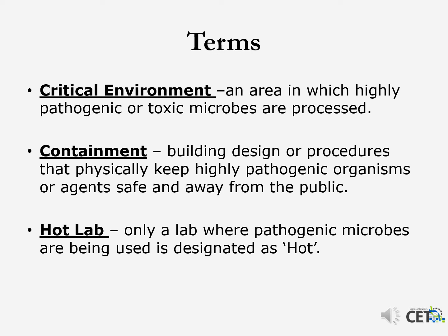The primary challenges working with microbes are contamination and aerosols. So we work on them in rooms that we call critical environments. The critical word is not about the room, but about the work we're doing and the microbes we're using. The way we handle that challenge is by containing those microbes or the contamination or the aerosol. And we do that either structurally by isolating that room, or mechanically with airflow, and sometimes with personal safety equipment.